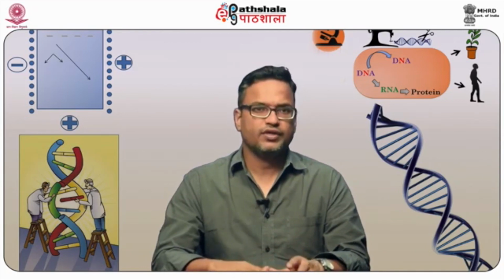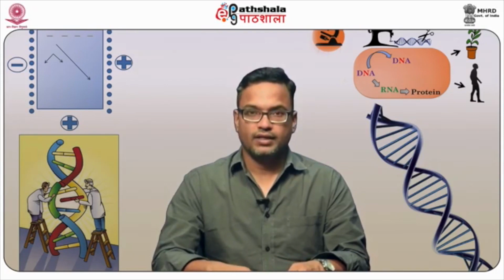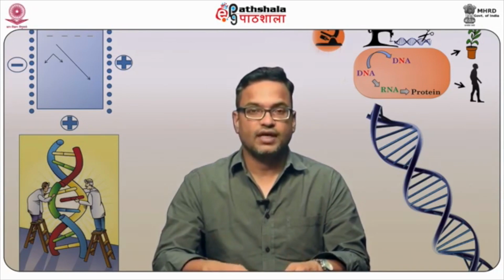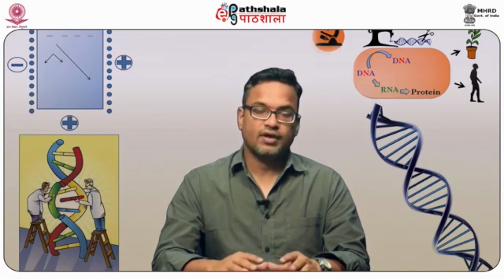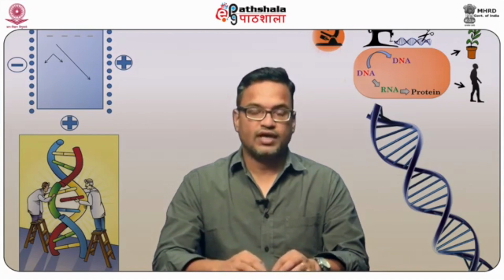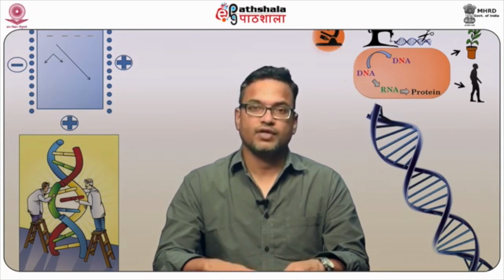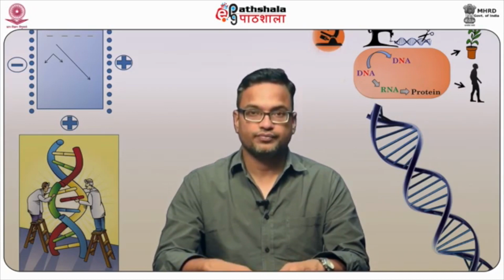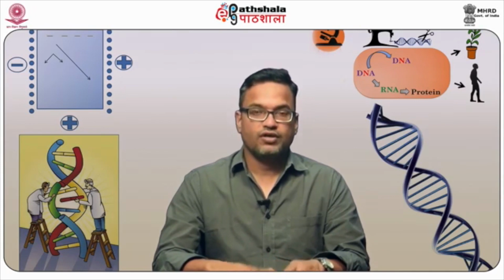However, the major issue with the radiolabeled probe was that it was highly unstable. It has a half-life, and the sensitivity is very high because you can detect any emission that is happening. But in that case you tend to get a poor resolution, because if the signal is very weak, then you have to expose it for a longer time. Therefore, you get a bigger signal, and in that you lose the resolution. Also, they were very costly and hazardous, because radioisotopes are hazardous to human health.